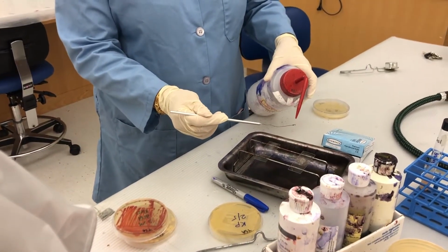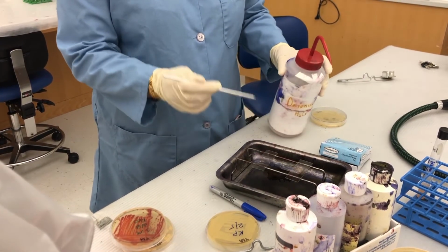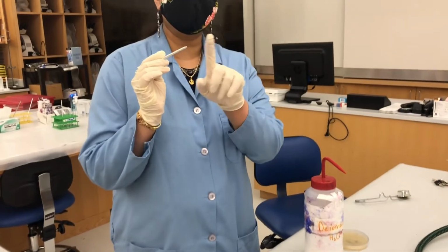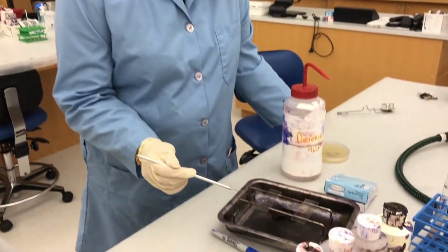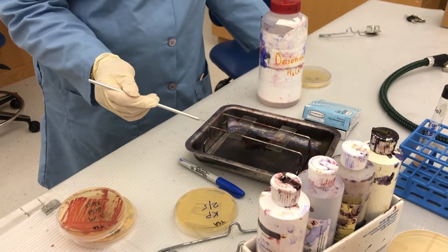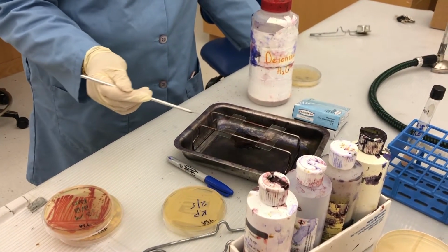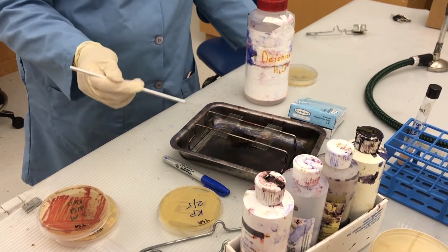So again, water, you don't want too much. I am making sure I have only a thin film here. Okay? So I'm going to tap, tap, and make a circle.